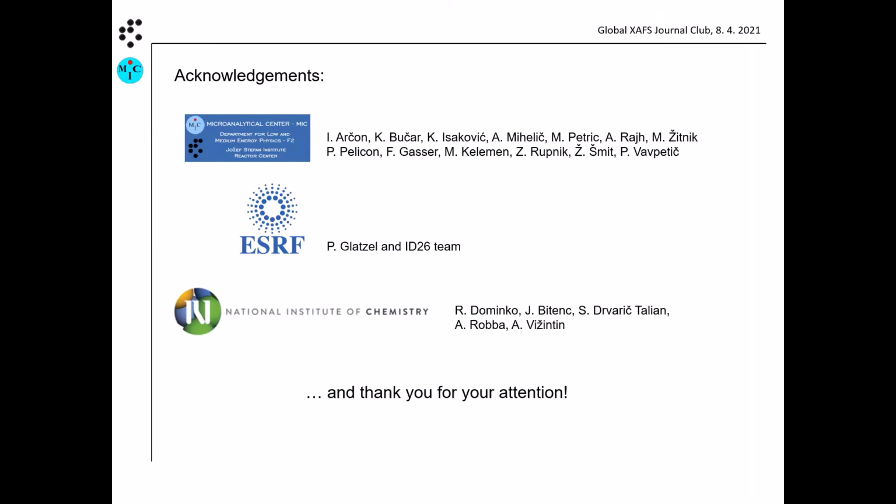All right, Yulia Pushkar, you have a question? Yeah, your mushroom spectra were kind of cute. I have a biological question. Did you try to measure purified protein, and what kind of concentration of protein do you need to have a signal on your lab-based system?